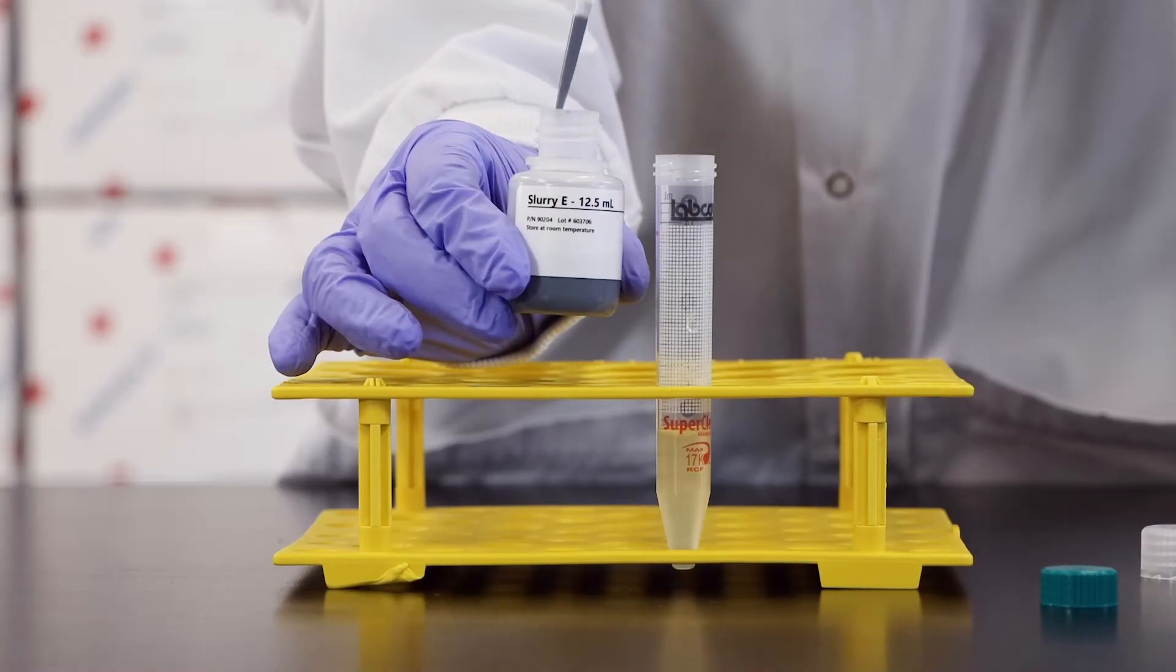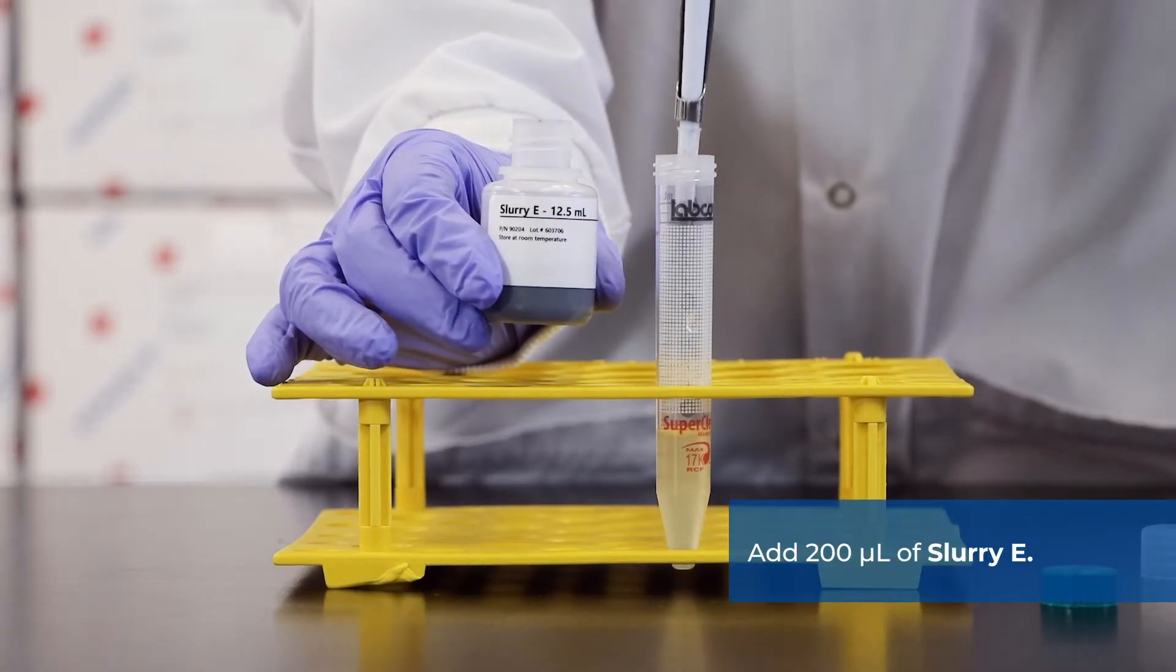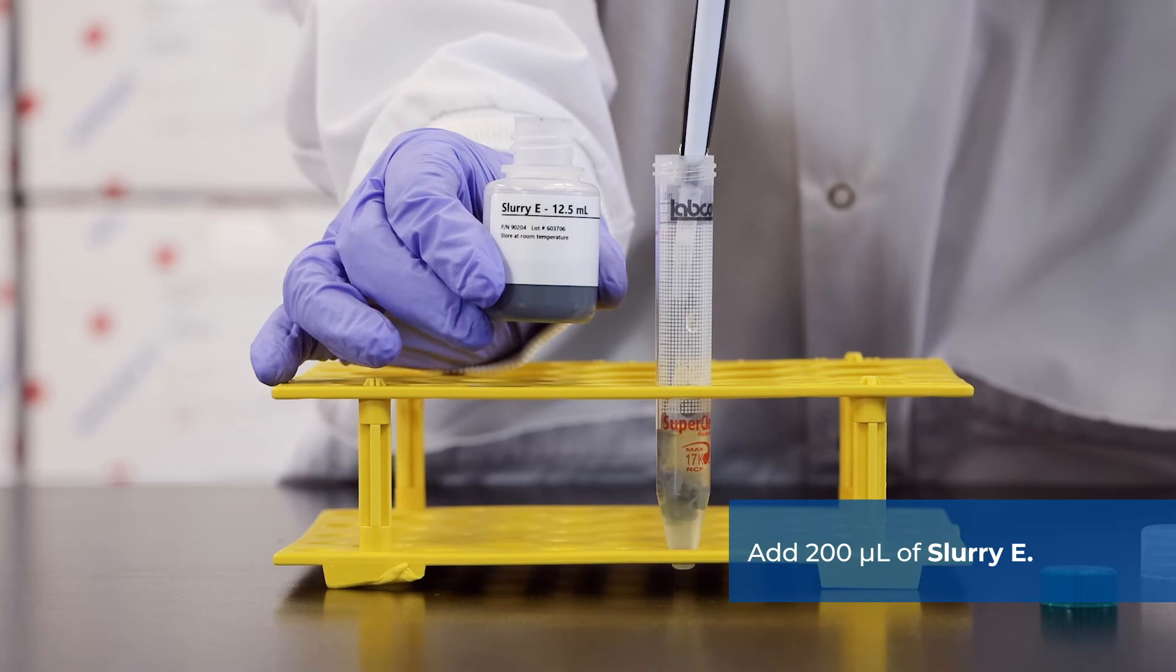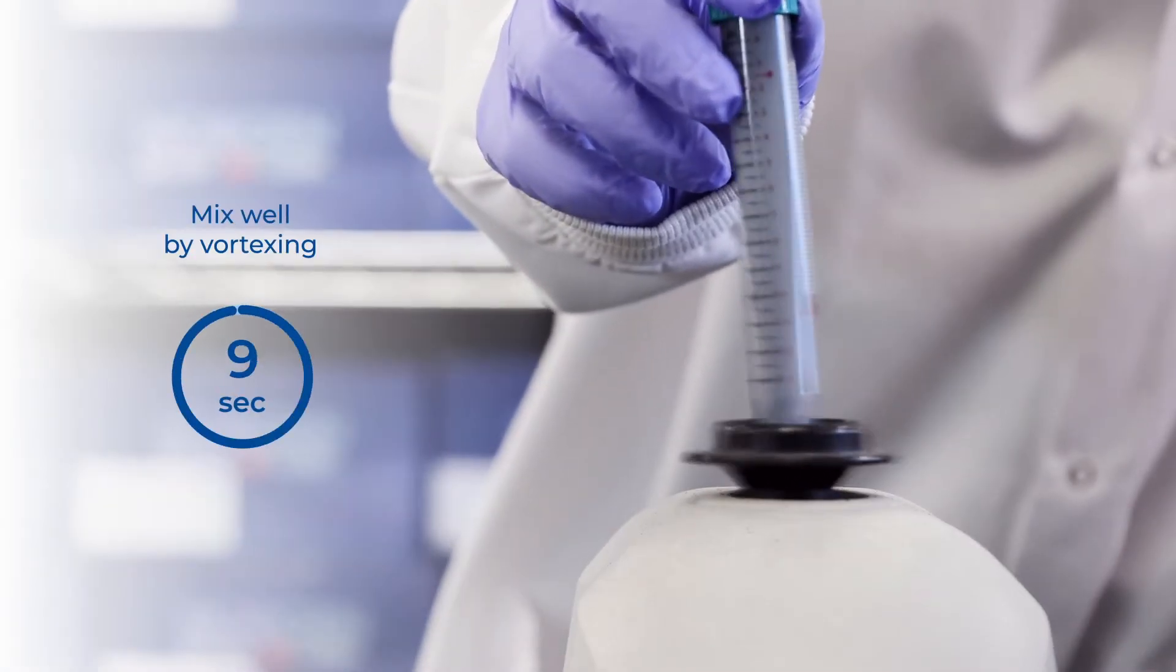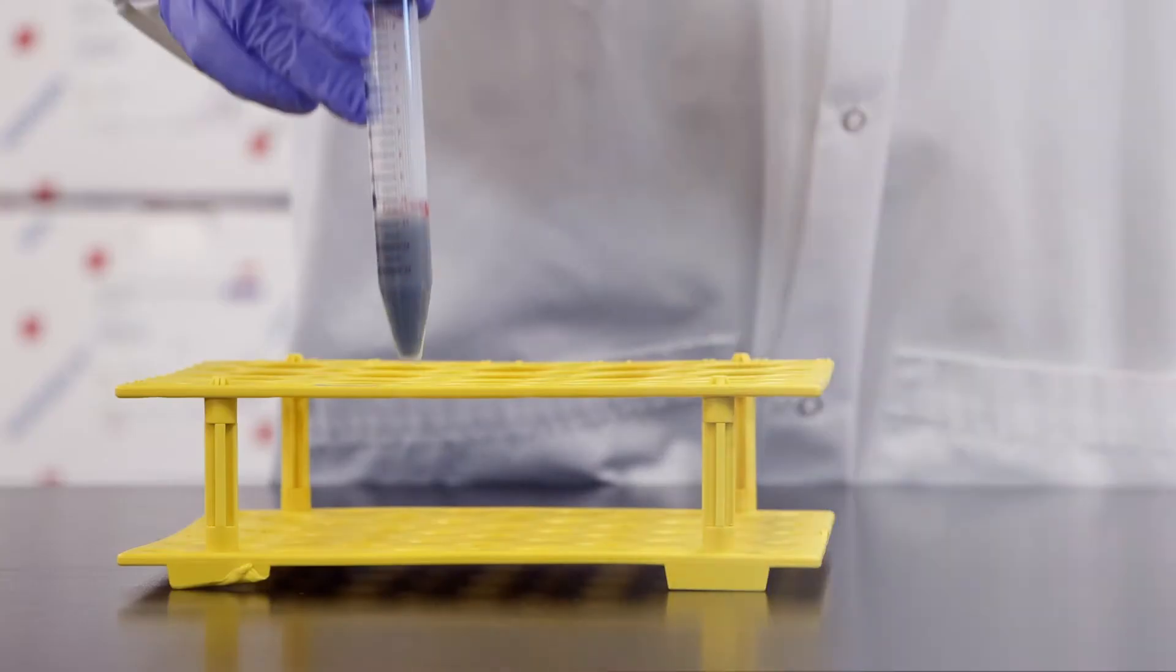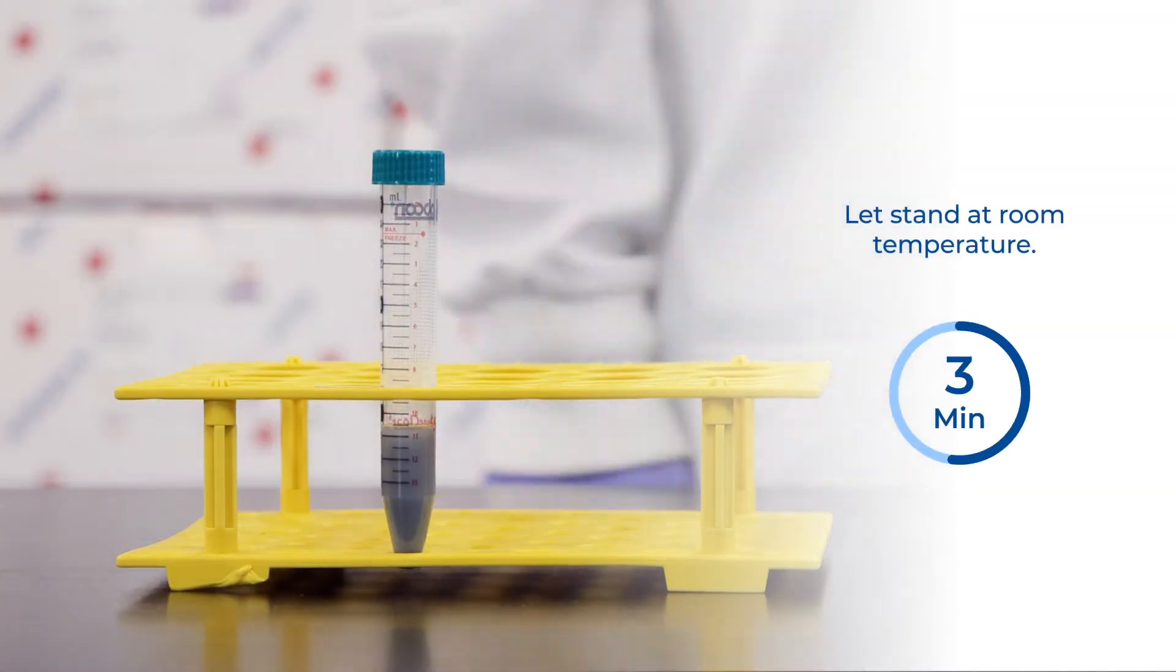To the mixture from the previous step, add 200 microliters of Slurry E. Mix well by vortexing for 10 seconds and let stand at room temperature for 5 minutes.